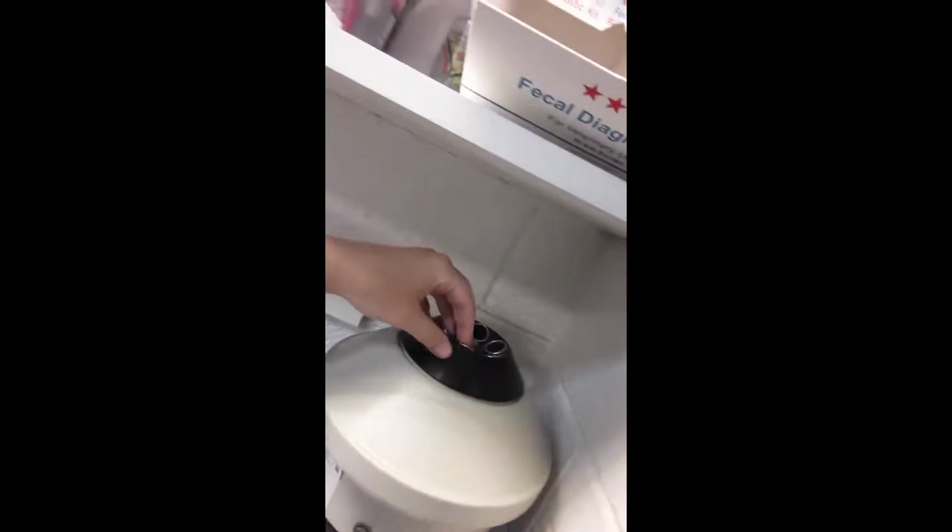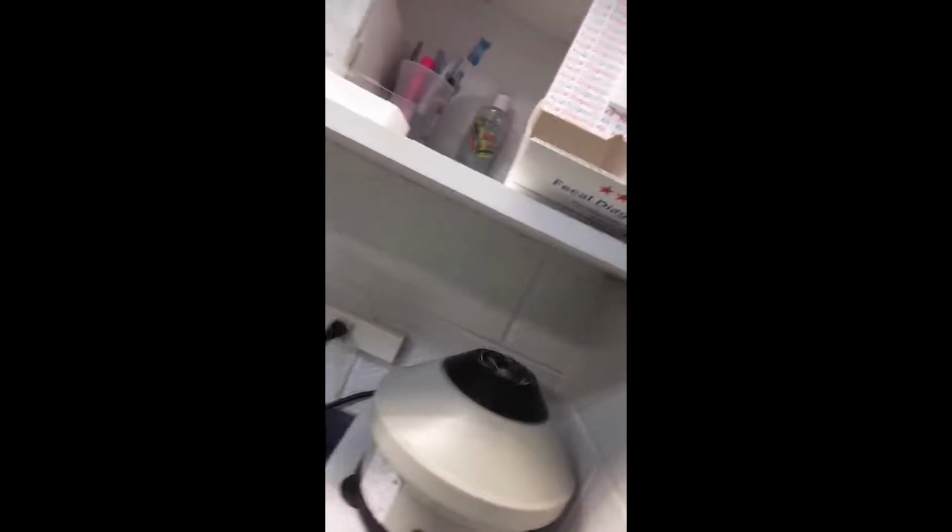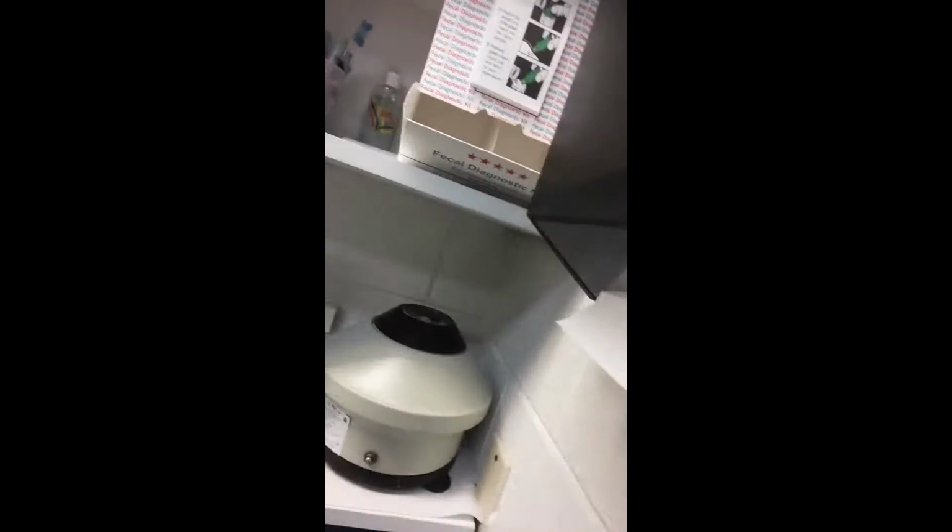Clotted, I'm going to go ahead and put it in the centrifuge. I've already got a balance in here that's equal to this tube here. So I'm going to go ahead and set it in there. And then I'm going to get a timer and set it for 10 minutes. Go ahead and start the centrifuge, and then we'll wait for the timer to go off, and then we'll stop it.